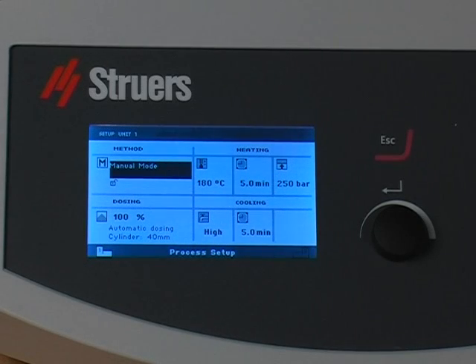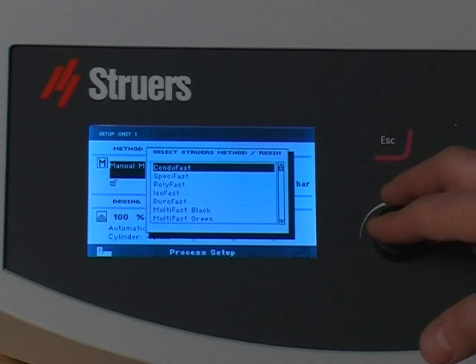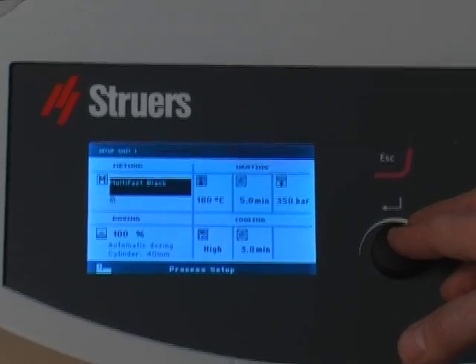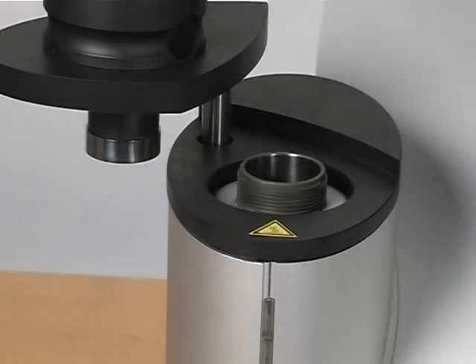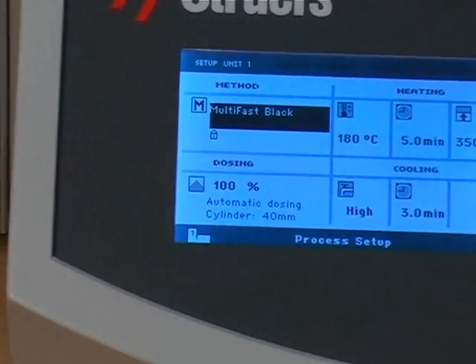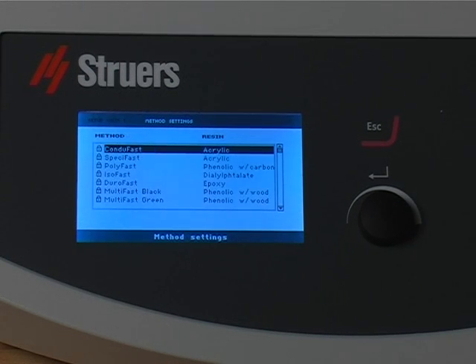As another first, we have integrated our hot mounting application guide into CITAPRESS. From a list, select any Struers resin, and CITAPRESS automatically checks the cylinder diameter used, adapts the appropriate method, after which it is displayed ready for use. A handy full description of the Struers resin is available online too.